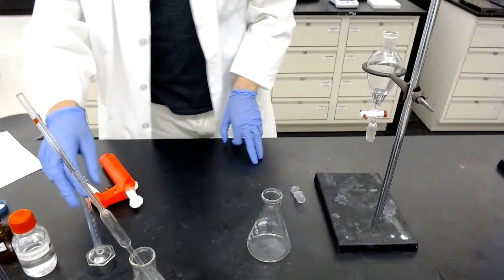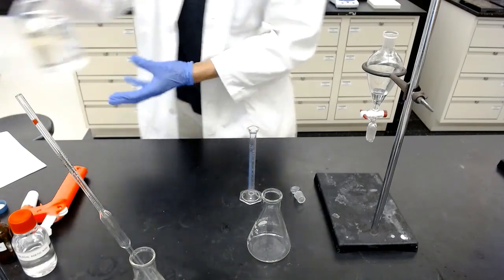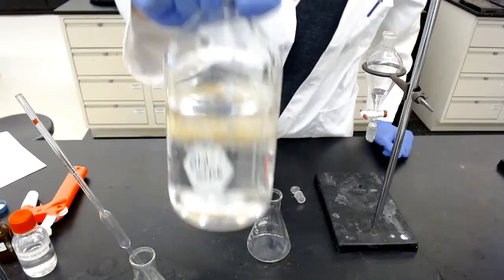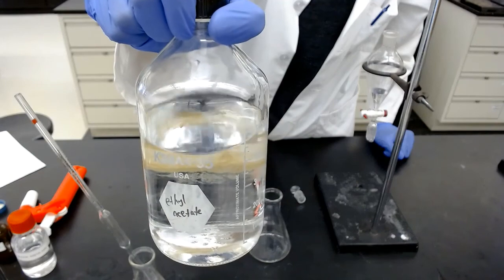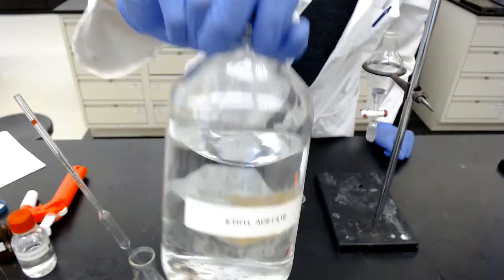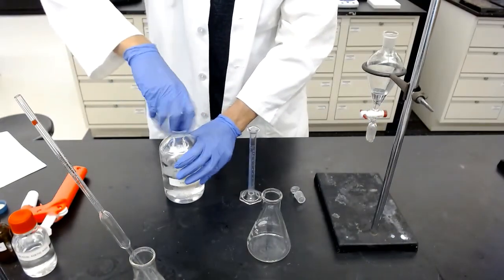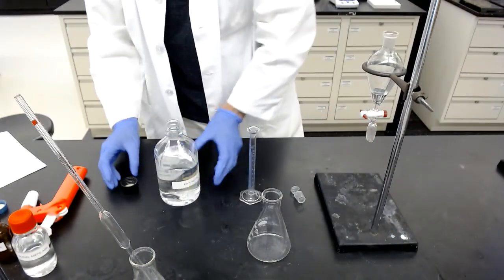And then I need ethyl acetate organic solvent. Right? I think on the better side, on this side. All right, ethyl acetate looks like water, but no, it's an organic solvent. We need 10 mL of it.